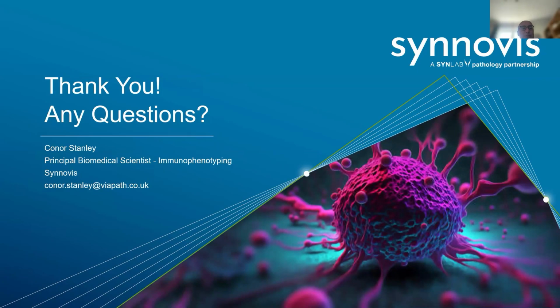Yeah, thanks. That's a really good talk. So thank you very much for that. My morphology always got a lot better when I knew what the results of the flow cytometry were. In fact, the older I got, the more I relied on the flow cytometry to tell me what I should be looking for down the microscope. And I don't think I'm alone in that, though maybe people still are very proud of their morphology skills. But the number of times that I got it wrong without it just emphasizes the power of the technique.